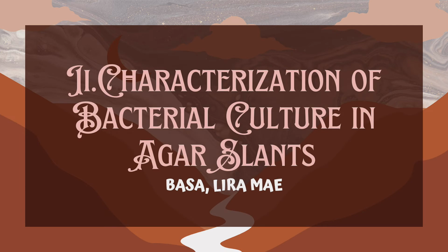After we tackle characterization of bacterial culture in agar plates, let's talk about characterization of bacterial culture in agar slants. Before we proceed, we must know what is agar slants. Agar slant is a culture made of slanting surface of a solidified medium in a test tube that has been tilted to provide greater area for growth, and also can be used to culture bacterial cells for identification.